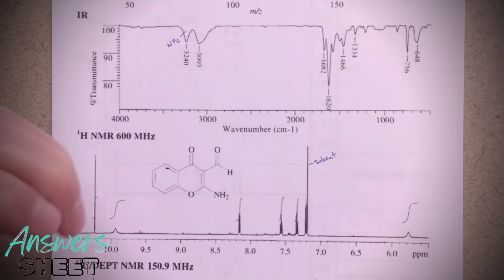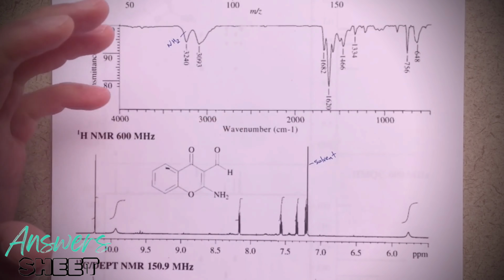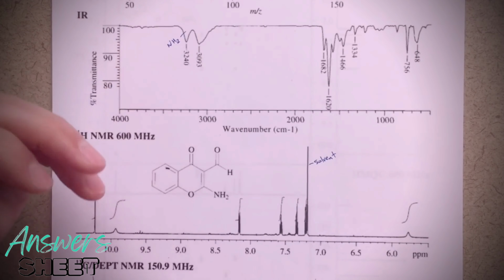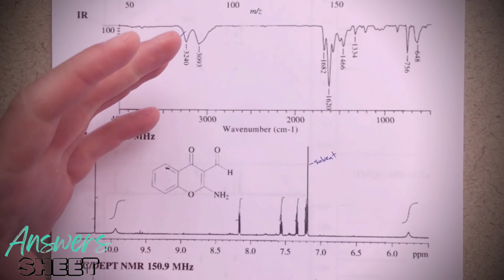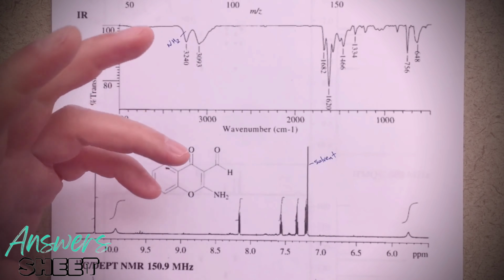And what we have here is a very interesting problem where I've got a variety of proton NMR, carbon-13 NMR, and two-dimensional NMR, along with an IR and a mass spec, that I'm going to analyze and discuss. This video is probably more tailored towards master's level organic chemistry or definitely advanced organic chemistry. The NMR data that we're going to be looking at is very complicated.